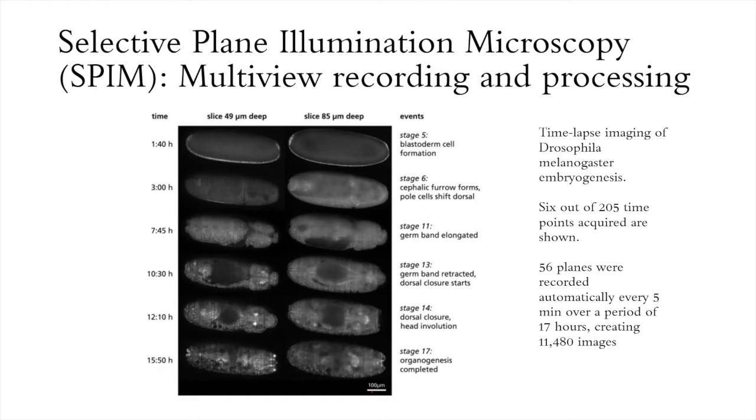For this figure, the images were orientated so that the illumination occurs from below. This results in a slight drop in intensity and clarity from the bottom to the top of each slice. Nevertheless, the information content across the embryo is nearly uniform, and we can clearly see the development of the embryo.